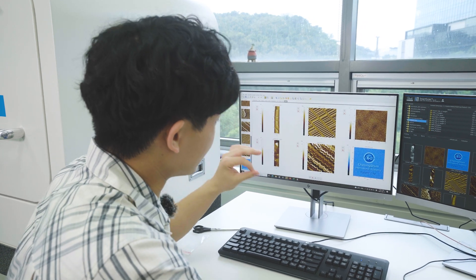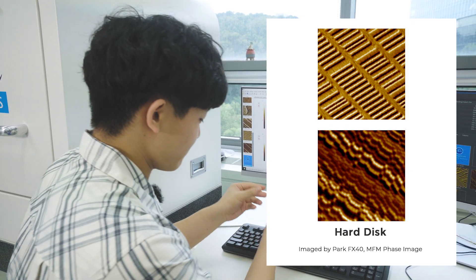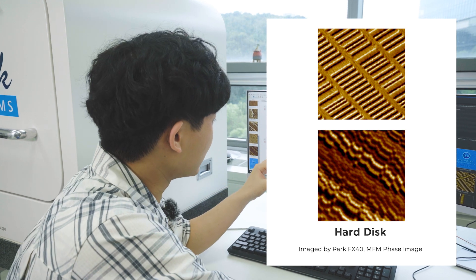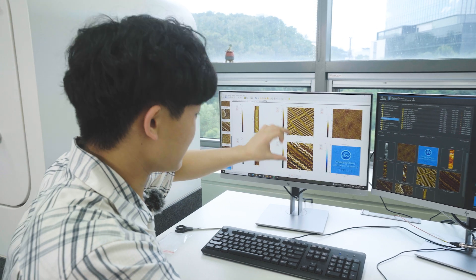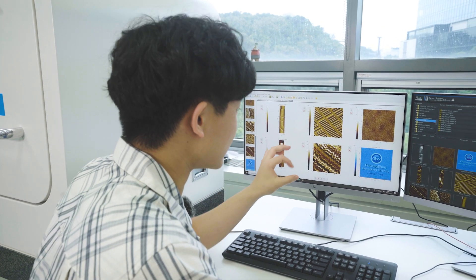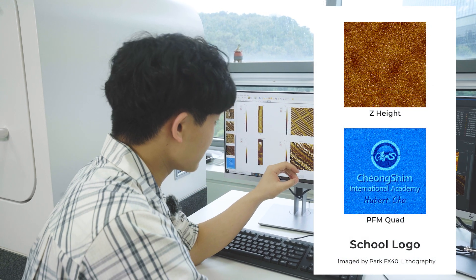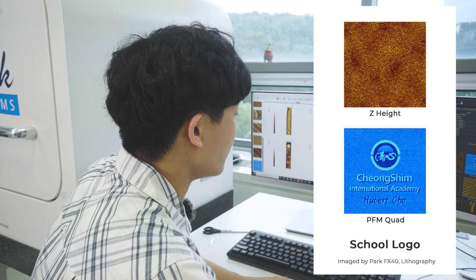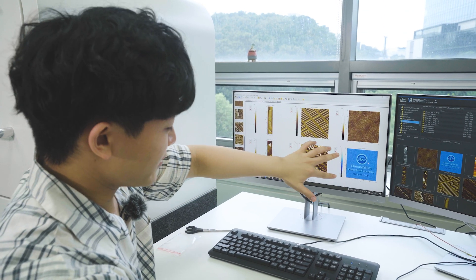Secondly, this is a picture of a hard drive. I was curious how data was written on a metal disc, so we scanned it using a magnetic tip. We can see that the data is written differently depending on the position on the hard drive — that was very interesting to see. Finally, we have the lithography design. We scanned the height and there's no design visible there, but when we scan using electrical signals, the design appears very clearly.